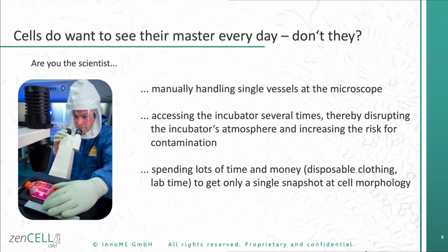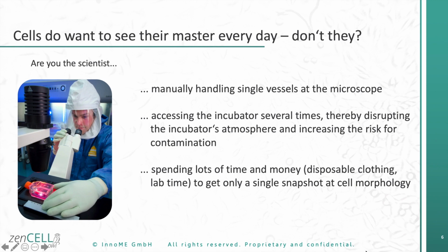But what we forget is that if we are the scientist that is manually handling single vessels at the microscope, retrieving them one by one from the incubator, this will mean we are accessing the incubator several times and thereby disrupt the incubator's atmosphere, increase the risk for contamination, and also disrupt the perfect incubation settings for the cell culture.